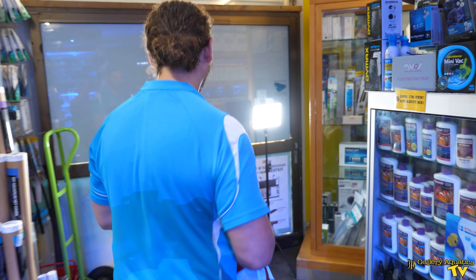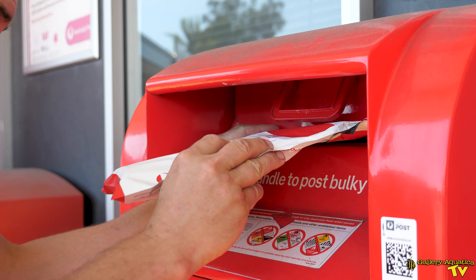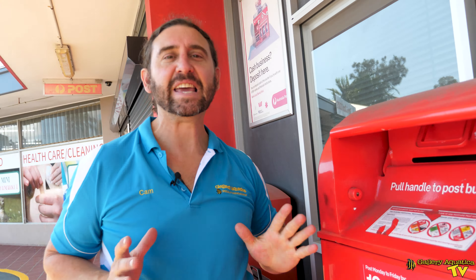Now we're going to post this off. After you've sent off your Triton ICP sample, it takes about one to two weeks to get your results.